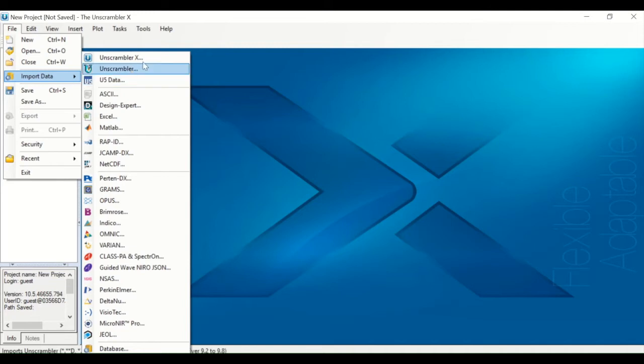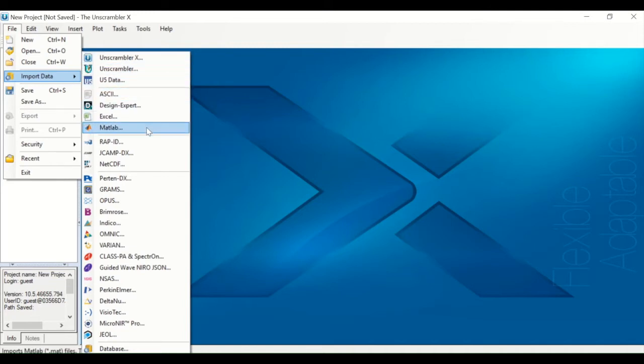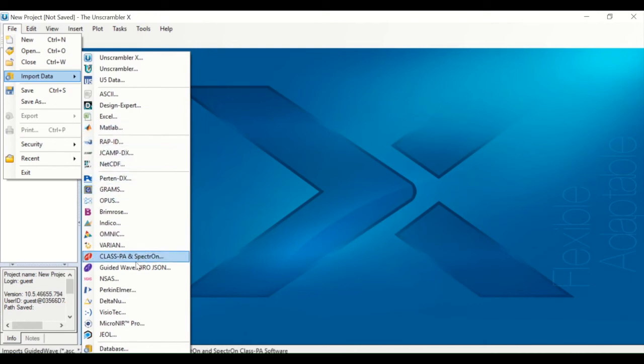Supported formats include files from current and previous Unscrambler versions, text, Excel, and MATLAB files, generic formats for spectral and chromatographic data, spectral proprietary formats, and imports from databases.